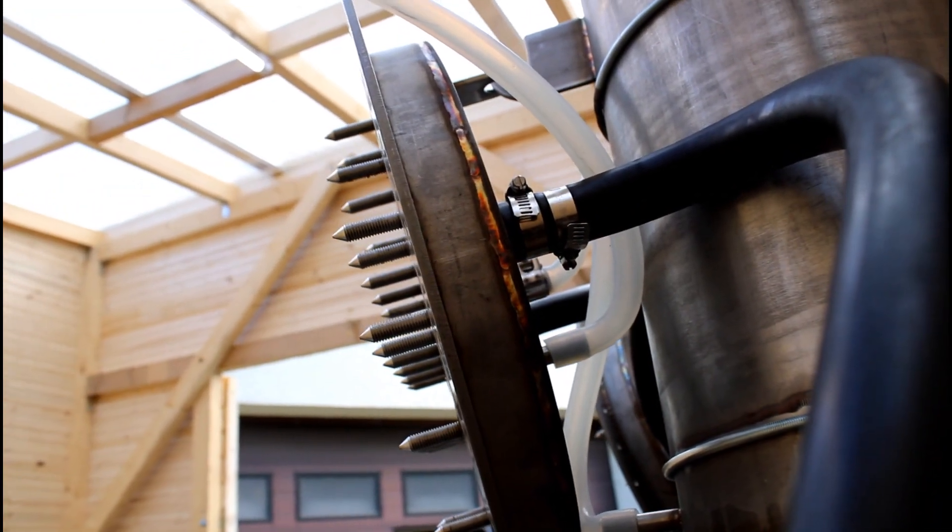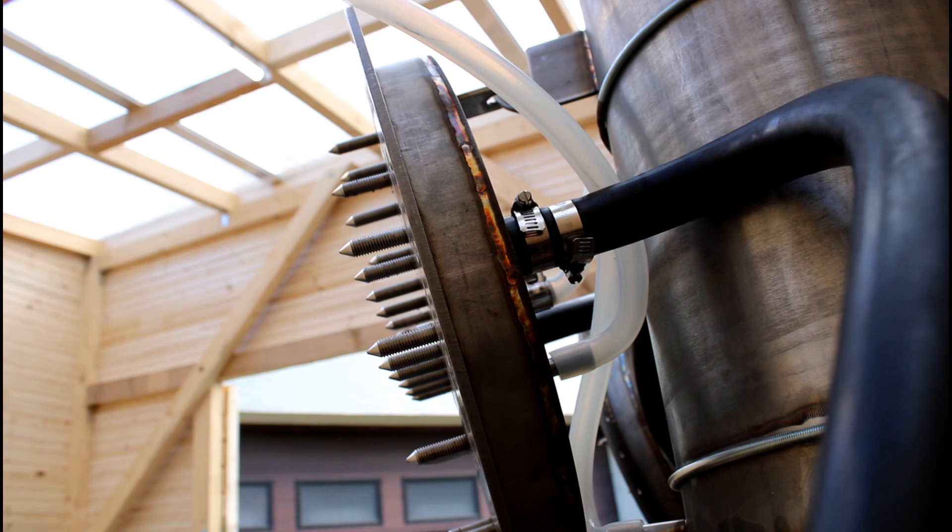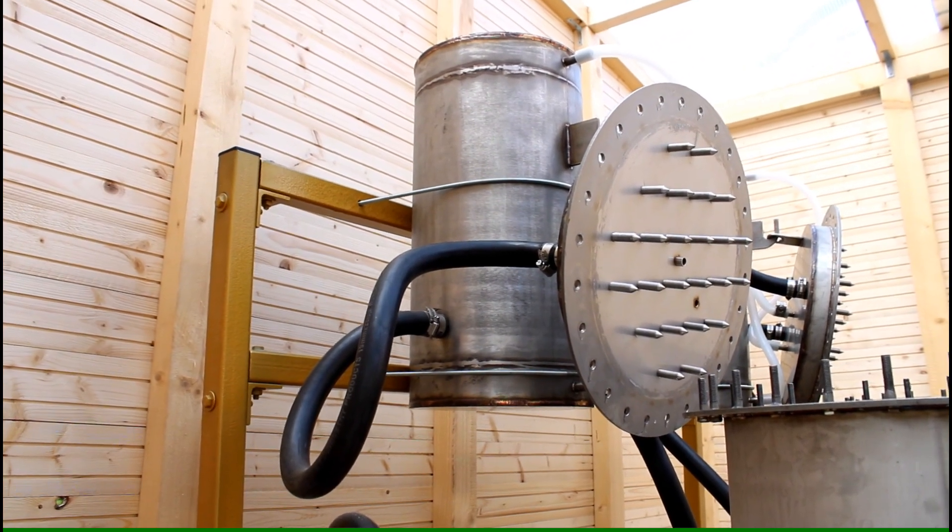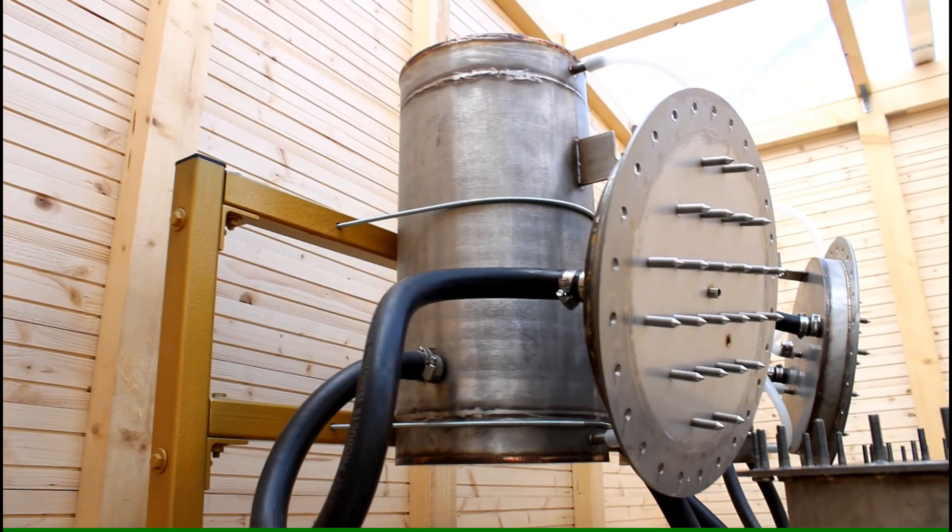This is the side view of the lid. So you see that the lid is actually actively water cooled.